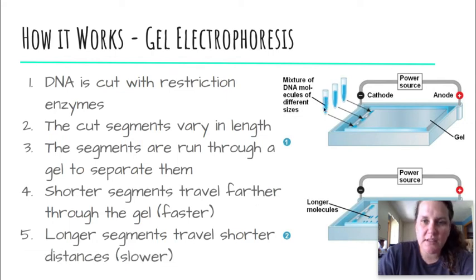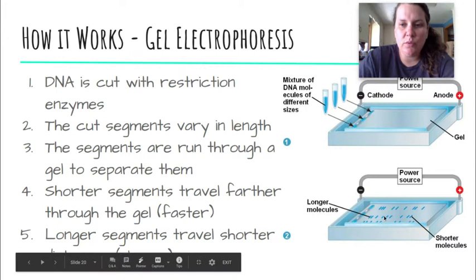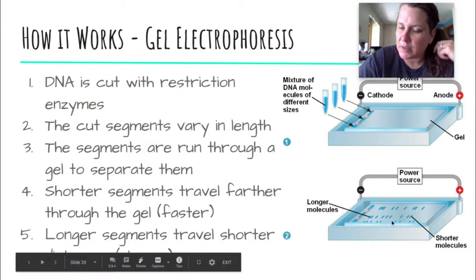So what happens then is they put the restriction enzymes in there, let the restriction enzyme do the work, and then there are these little wells in the gel, and they will pipette that DNA and restriction enzymes into the well, and then they will put electricity through it. As the electricity goes through it, it will pull the DNA bands through the gel. And then once it's done, it's traveled as far as it's going to go. Okay, that's great. Then it has the banding pattern.